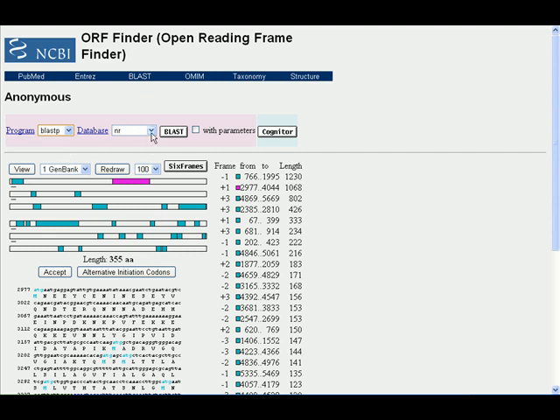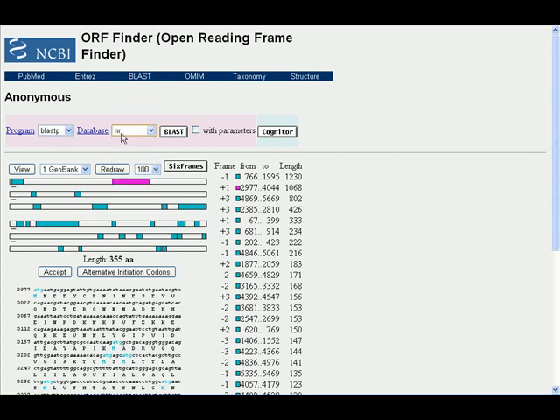We can select here the type of database. For example here is the non-redundant database. And you click on BLAST. It will show us the matches to our open reading frame.